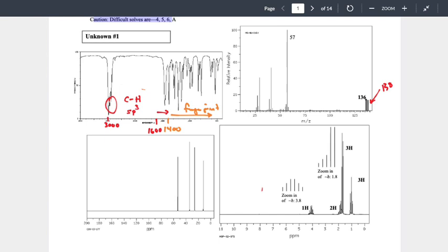Could it be 57 hydrogens? Why not? Yeah. We're going to have a hard time trying to bond 57 hydrogens together and the bromine. Right? That's just not going to happen. We're going to have octet issues. Which means it's more than likely that we're seeing more carbons than we are hydrogens. So we could start that 57 by looking at the carbons.